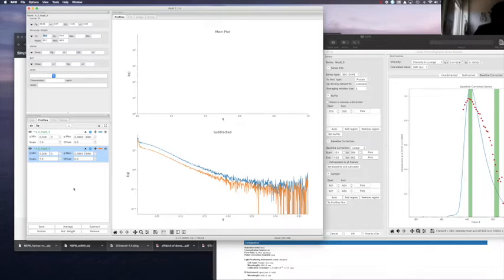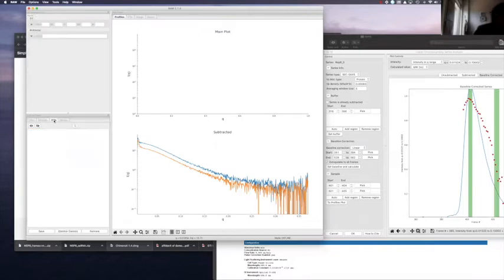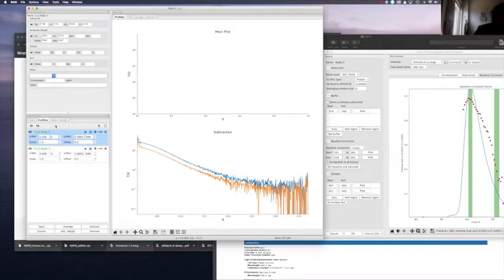Now what we can do, and I will do it in a very fast way, is take the most monomeric state, that's the orange one. But let's just calculate the P(r) function and compare those. What's really changed? How is this monomer-dimer mixture versus more monomer? How did the P(r) function change? And that was already shown by Steve. I'm going to repeat myself, or repeat his presentation.